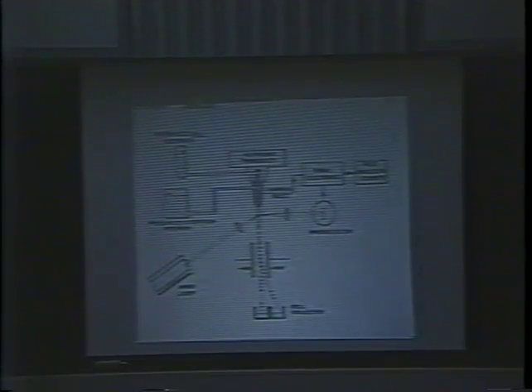Working together, the engineering group was able to overcome the technical obstacles. Two successful prototypes were built: a 1969 instrument that employed a mercury arc lamp as light source, and a 1972 version which used an argon ion laser to detect cells tagged with fluorescent markers.